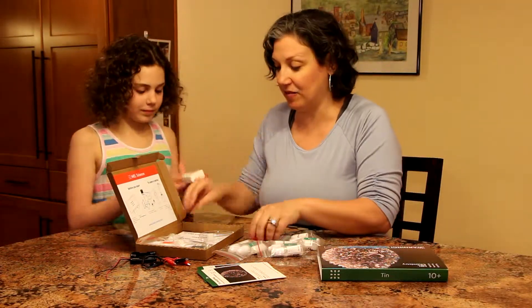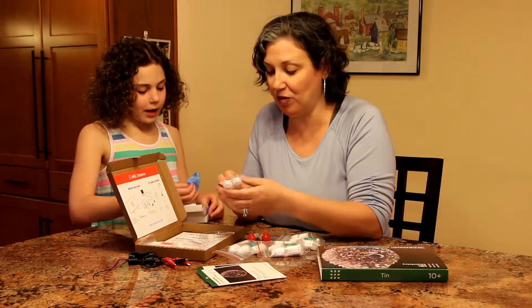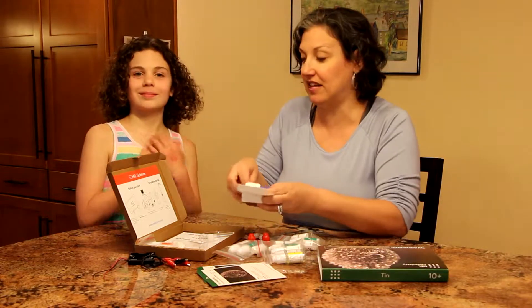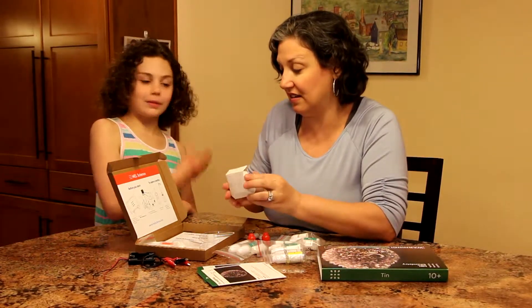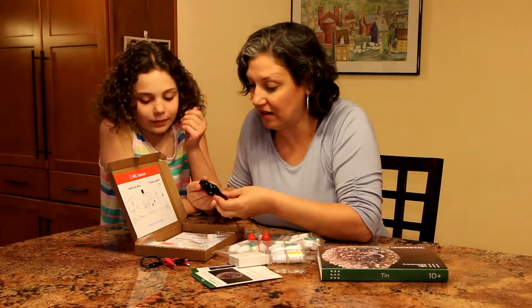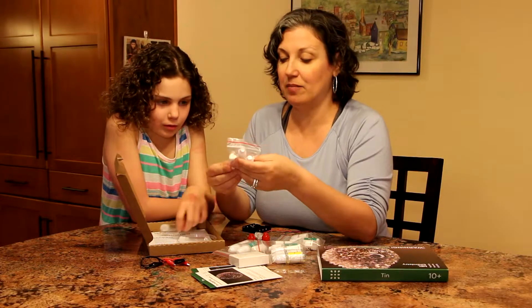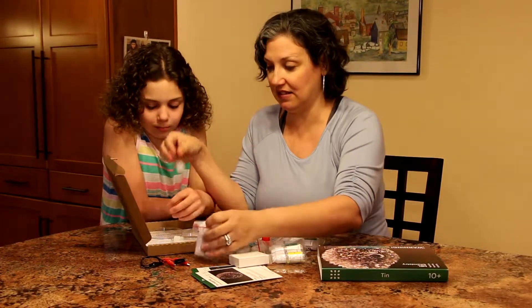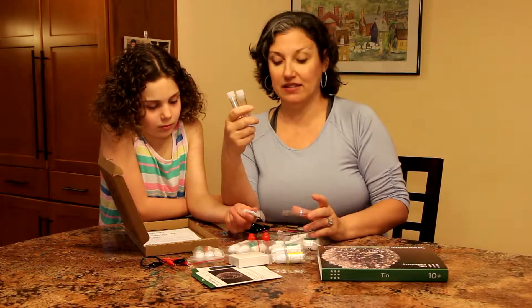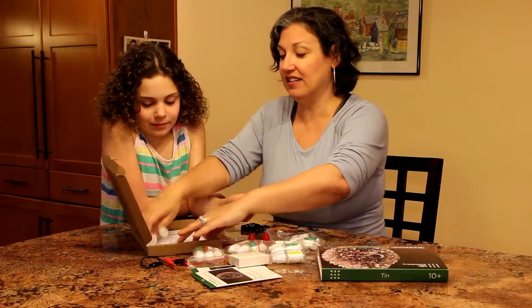I think these are little gloves. Let's open that up and see. They are gloves! Liquid soap and zinc. Hey mom, they have them in our favorite colors — purple and blue! They do give you some safety gloves in our favorite colors. I love both of those colors. We're going to need some triple A batteries — four of those. I'm guessing these three are the thermometers. This is absorbent it says. And then these are your chemicals. And they gave us some petri dishes and some containers. So we're going to go and learn how to do this lab.